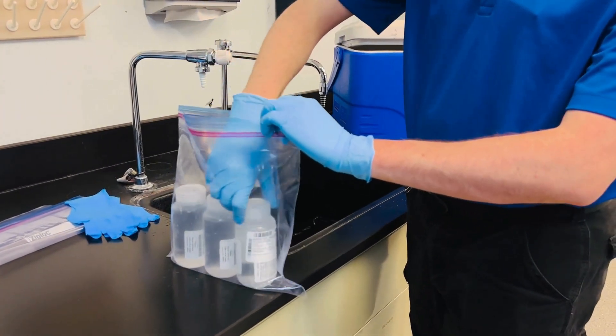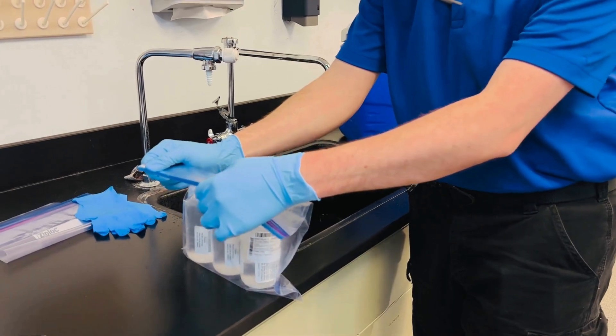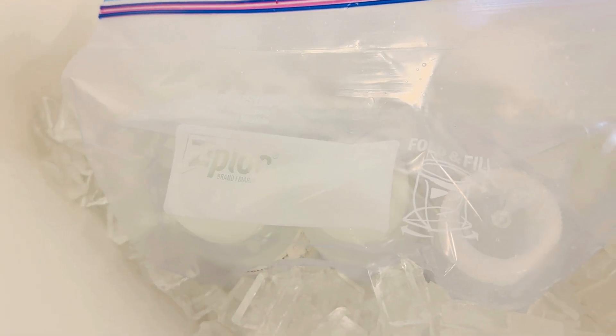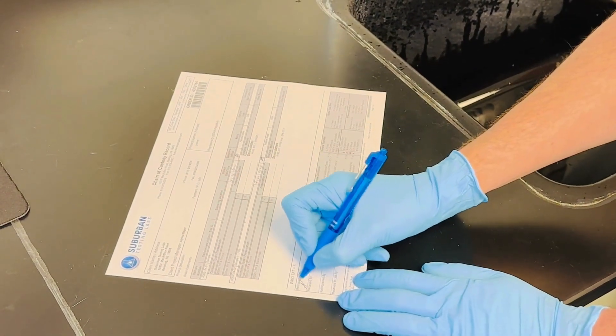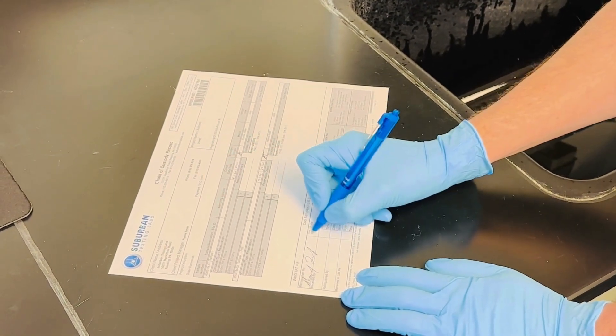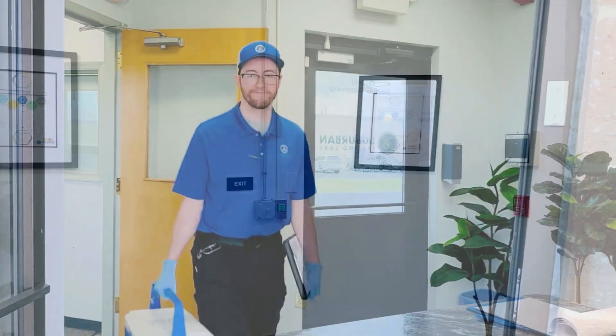Keep sample bottles from different sampling locations bagged separately to prevent cross-contamination. Put the bagged samples on ice as soon as possible after collection and ensure they are transported to Suburban Testing Labs on ice. Sign your chain of custody form and ensure you've filled out the site ID, date, time, initials, and relinquished by fields. Then get ready for transport.